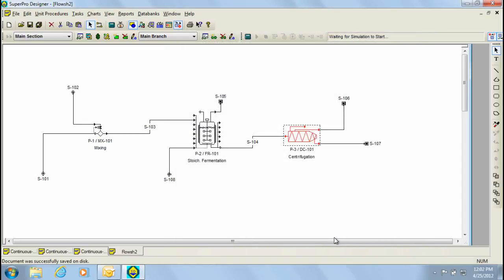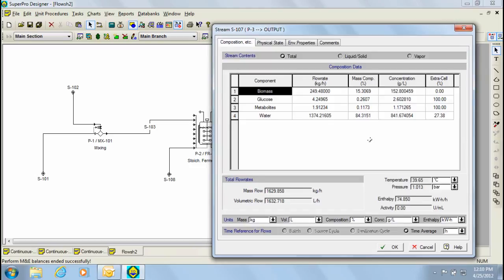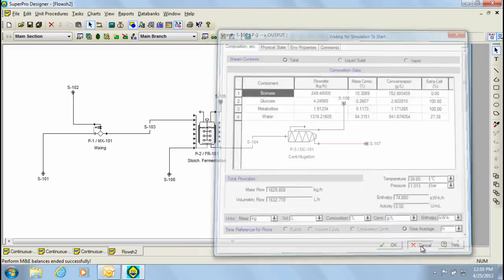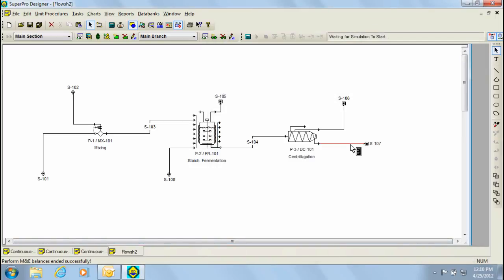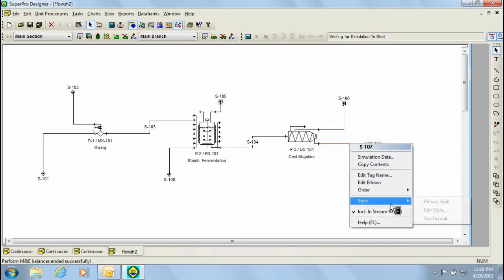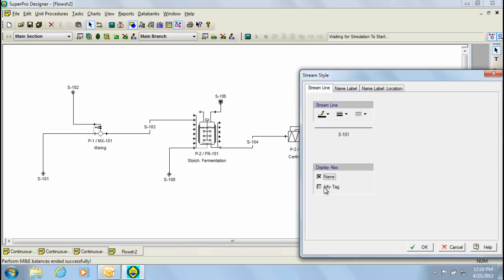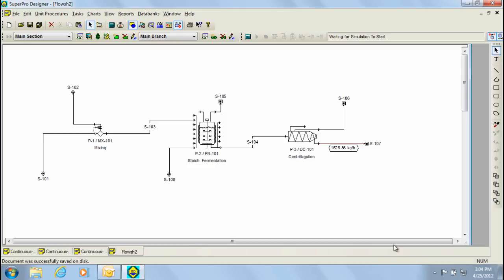At this point, we're ready to carry out the calculations, which can be done by clicking on the Calculate button. Notice that when the calculations are finalized, the following message is displayed. You can now proceed to click on the streams to view the output results. Another option to view the results is by displaying the value in the stream itself. This can be done by right-clicking on the stream, selecting style, edit style, and then clicking the display info tag option. This concludes part 1 of this video tutorial series. Please make sure to watch part 2, where I'll discuss recycle loops and their convergence. Thanks for your attention.